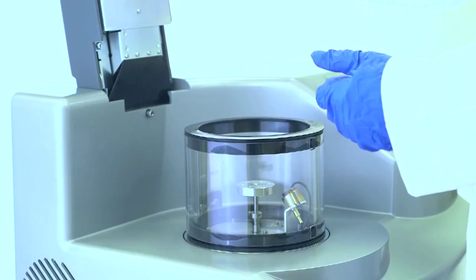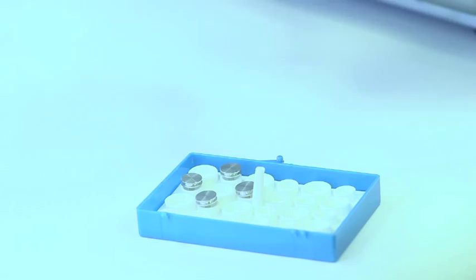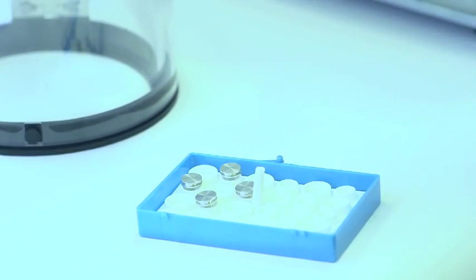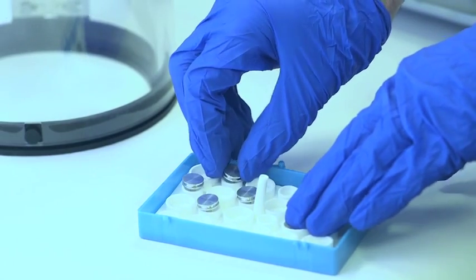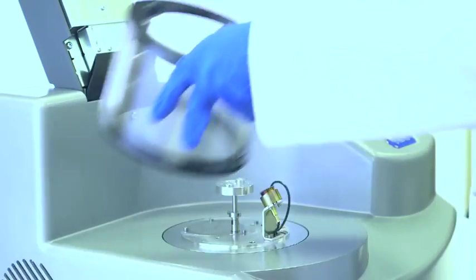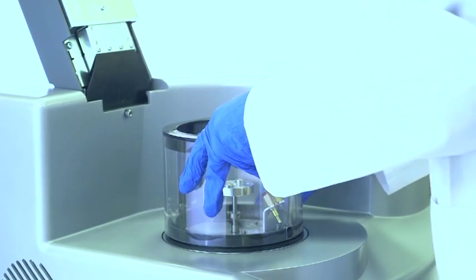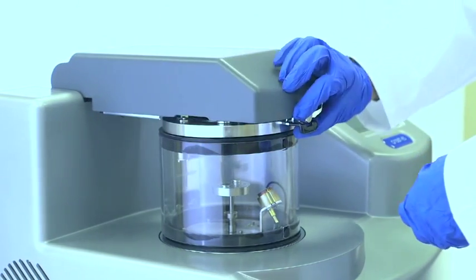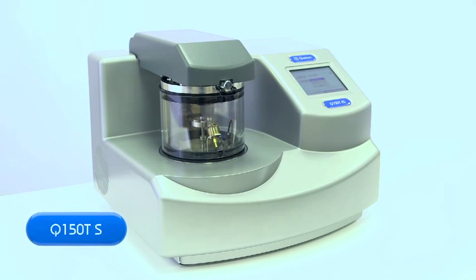The top-of-the-range Q150TES is a high-vacuum turbopump coater, which provides sputter coating and carbon or metal evaporation in a single system. These units are also available as discrete sputter coaters and evaporators, Q150TS and Q150TE.